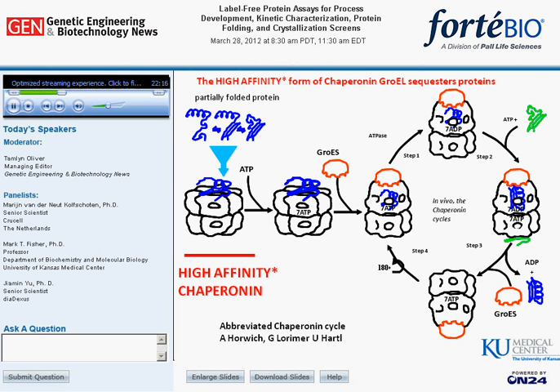The binding strength of the high-affinity ATP-free chaperone often approaches affinities observed in antibody-antigen interactions. In vivo, this binding affinity is reversed by ATP binding and hydrolysis. In this talk, we will illustrate how we can use this high-affinity chaperone in our novel ligand screening platform while avoiding general aggregation. Next.